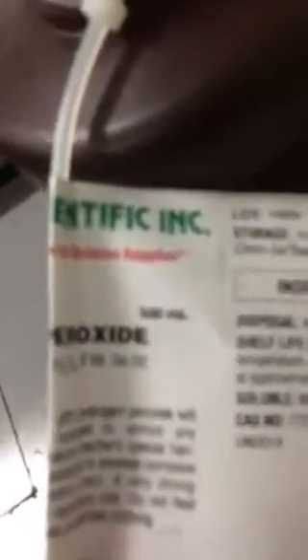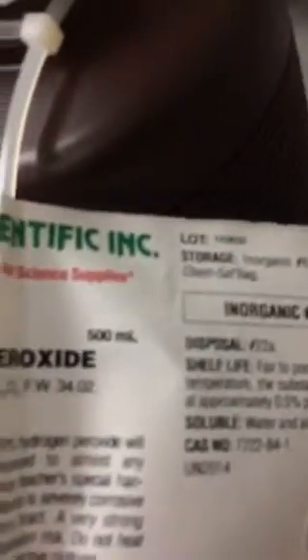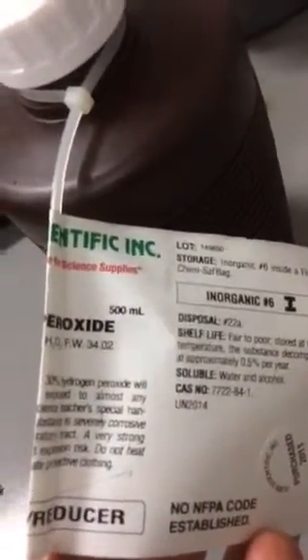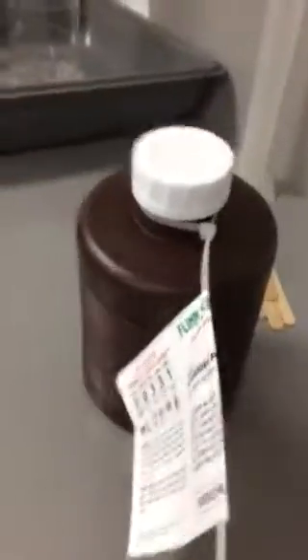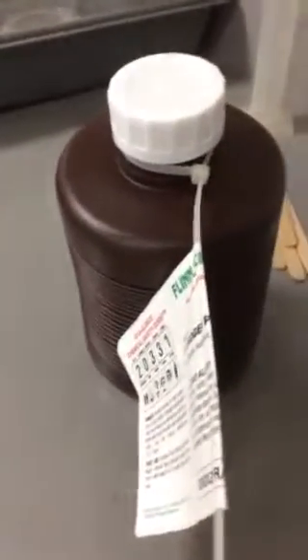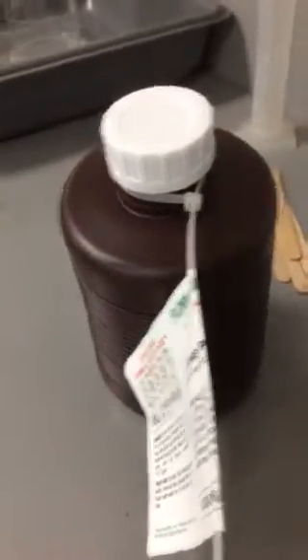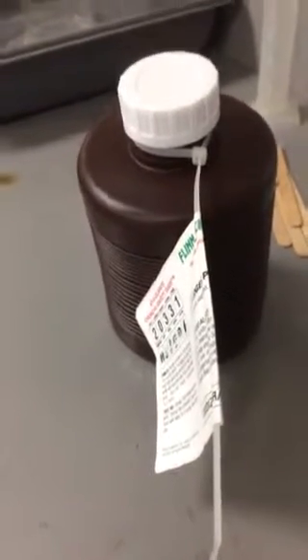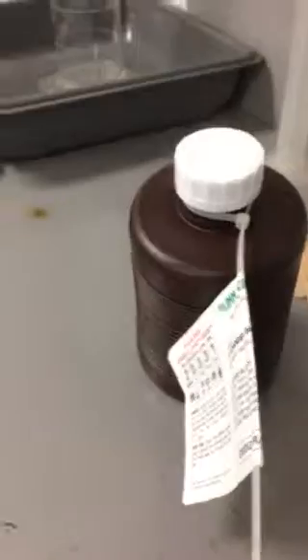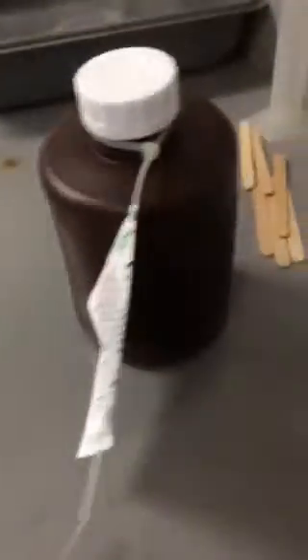Okay, if you look at this, I've got 500 mils of, where's the percentage? I guess it doesn't say it on here, but this is 30% by mass, or by volume, hydrogen peroxide versus water. The hydrogen peroxide that you get in stores is about 5 to 6%. Big difference. So what we're going to do here is, first of all, we got to get our hydrogen peroxide.